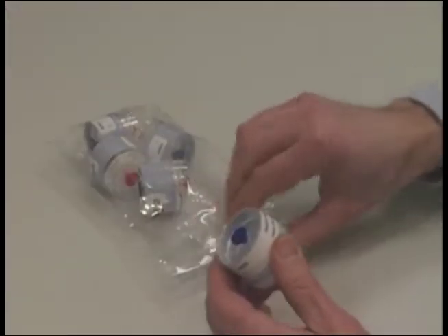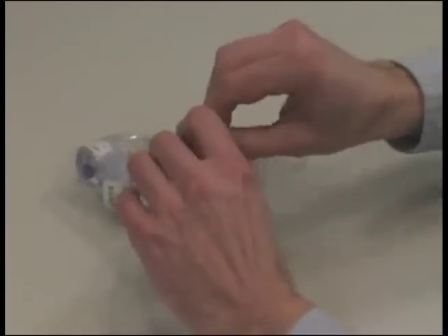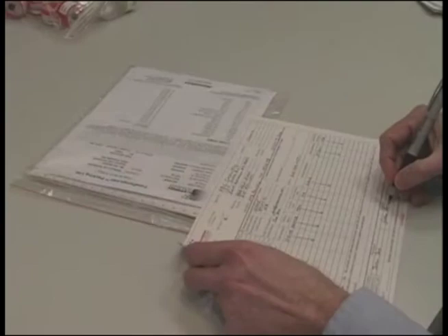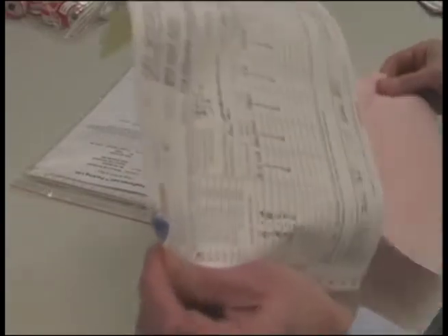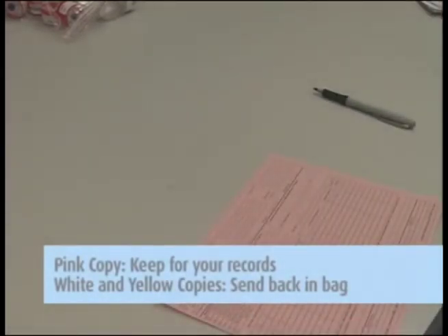Reinstall the nibs on each end of the cassettes and place the cassettes in the Ziploc bag for shipment to Galson Laboratories. Then complete the chain of custody form. It is important that you include all the information requested in order to ensure the turnaround time of your samples. Remove the pink copy and keep this for your records. Send the white and yellow copies in with the samples to the lab in the large Ziploc bag.